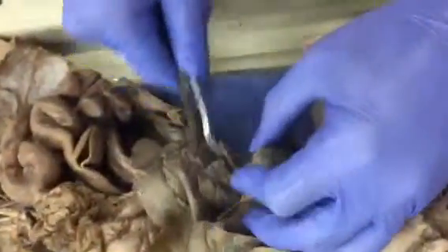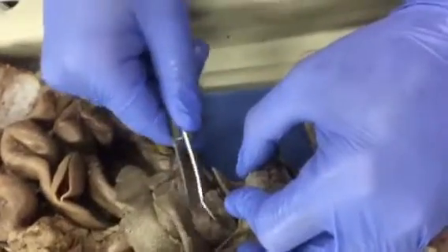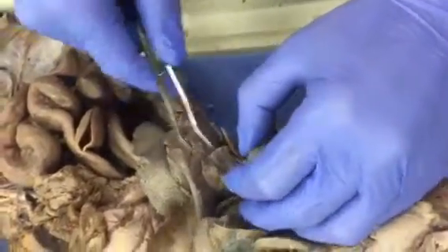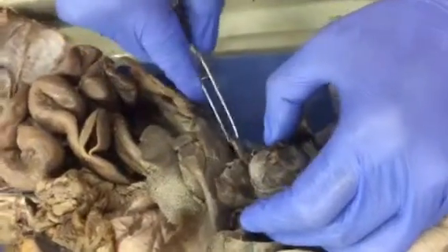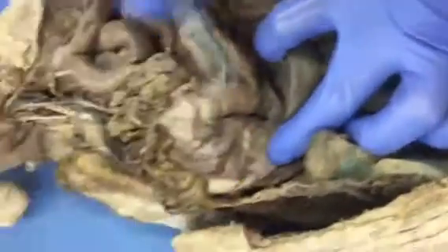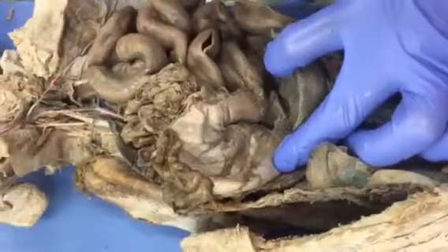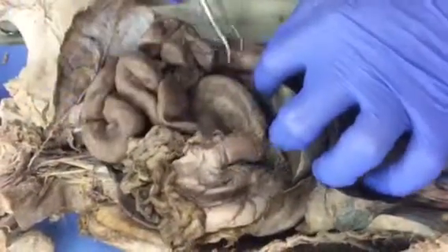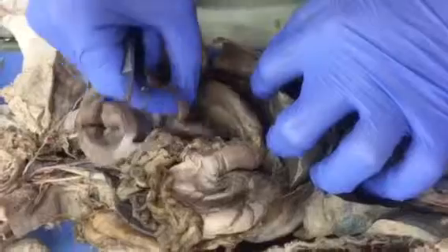This is your accessory lobe of your lungs, if you have to know that. Greater curvature of the stomach, lesser curvature of the stomach, pyloric region. This is your duodenum.